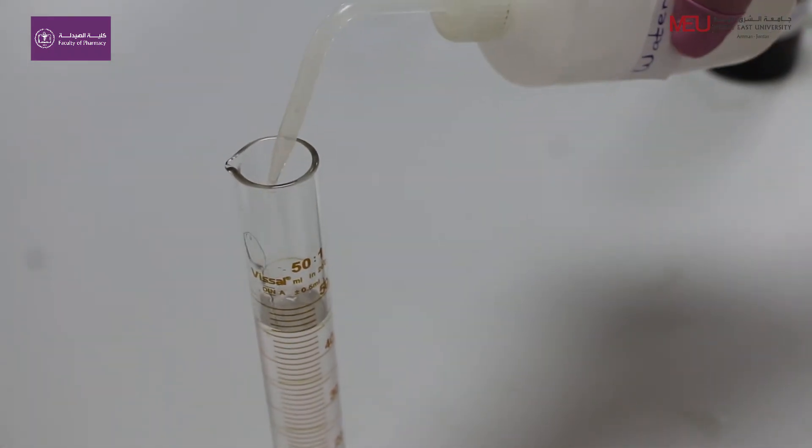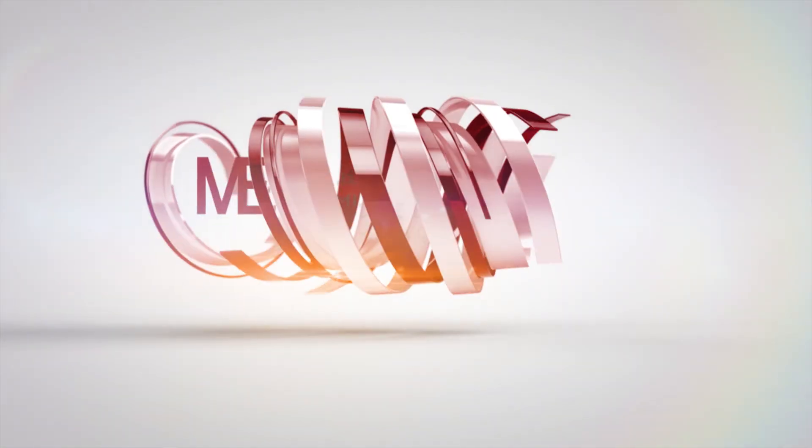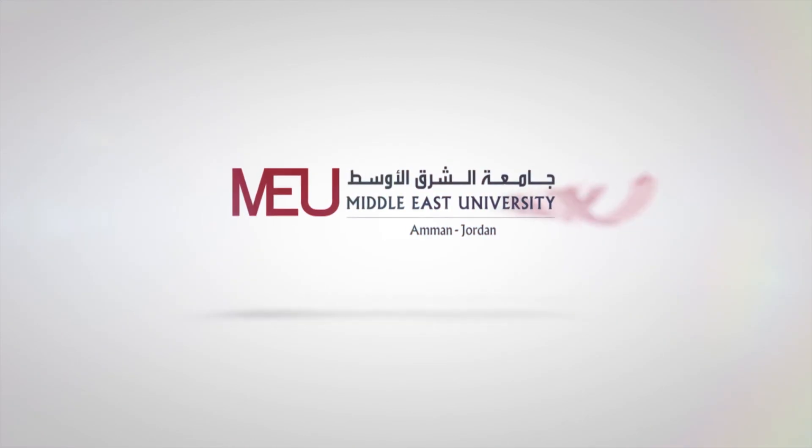Add purified water up to 50 ml to reach the required volume. Add 5 ml of olive oil.